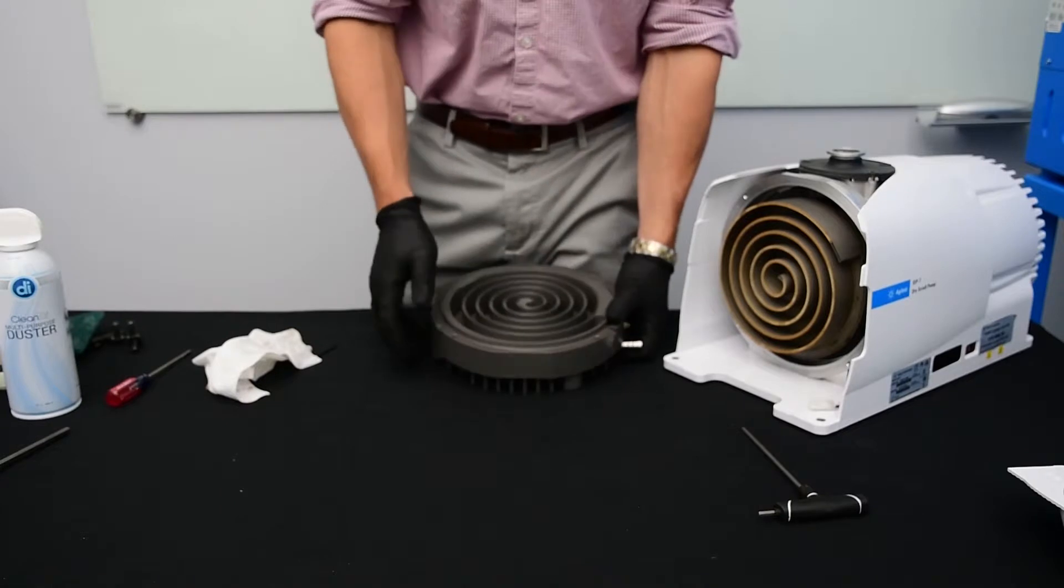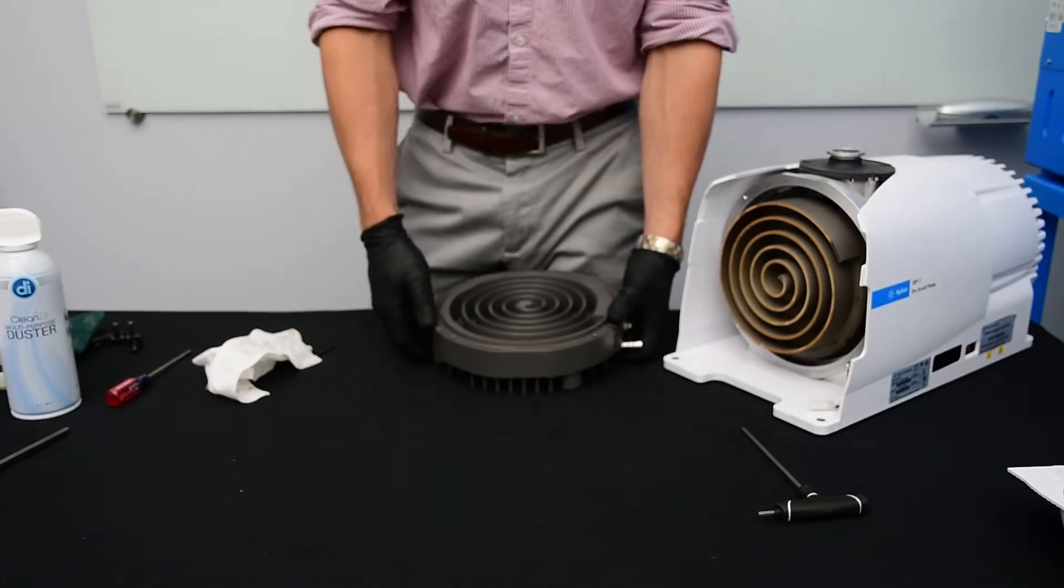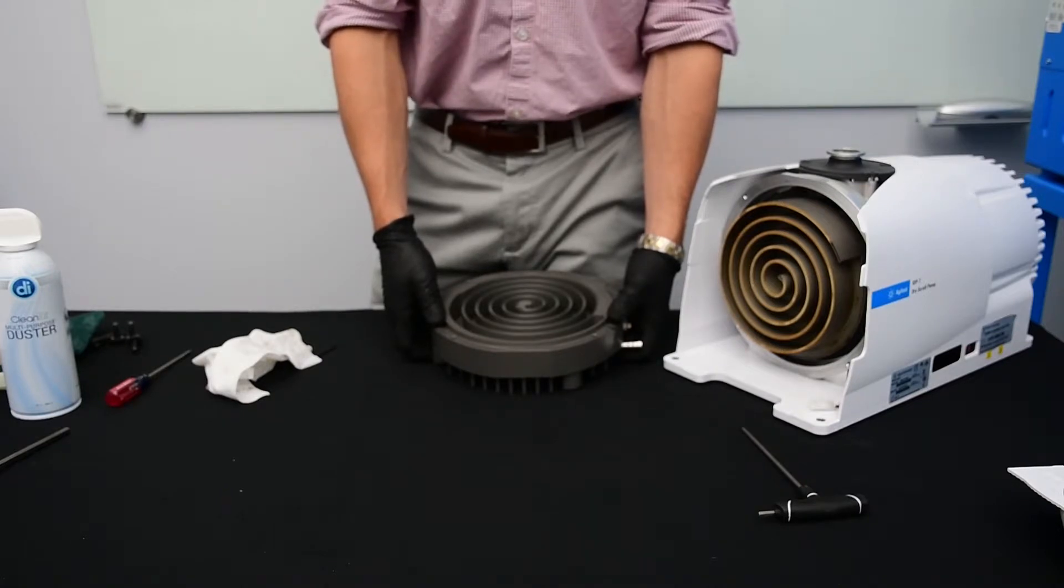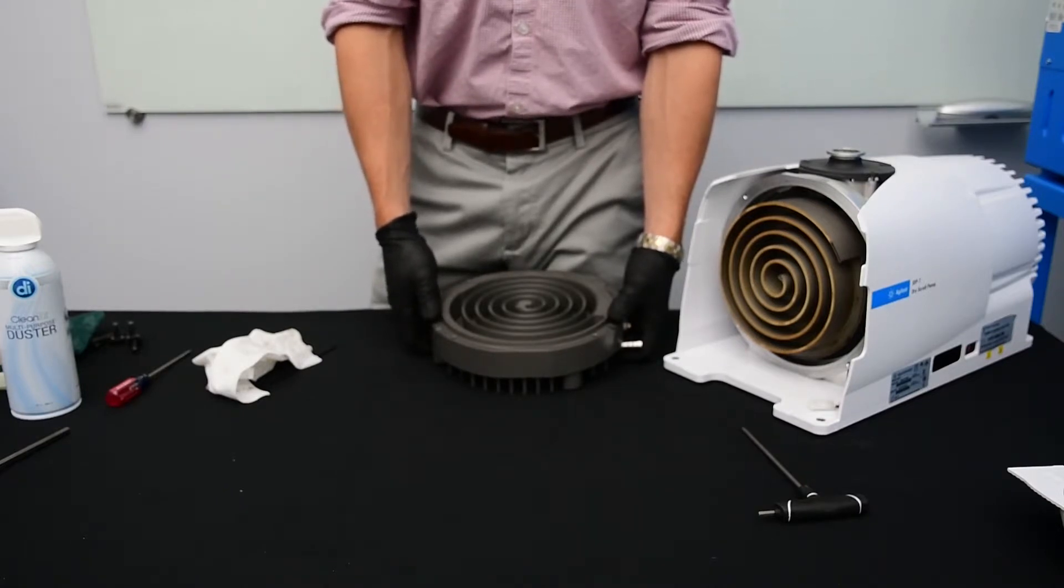Now that we've finished the outboard housing, we're going to move on to the orbiting plate of the scroll. We'll follow the same procedure to change the tip seal and clean the pump on that side as well.